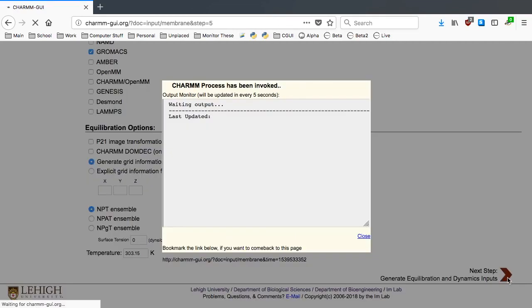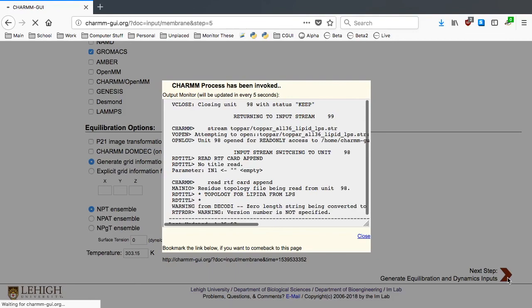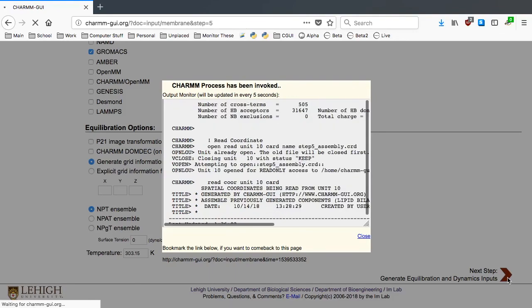Since Membrane Builder generates all necessary restraint files and performs some minimization for non-CHARMM programs, it will take another 5-8 minutes.